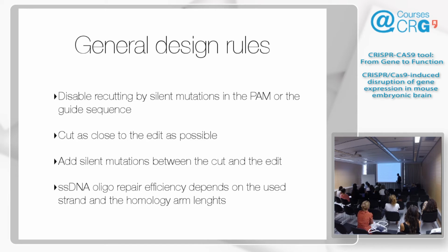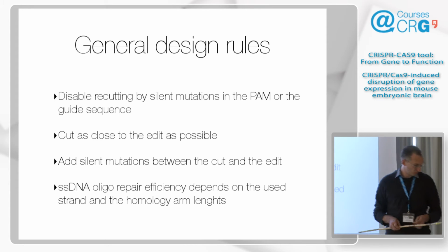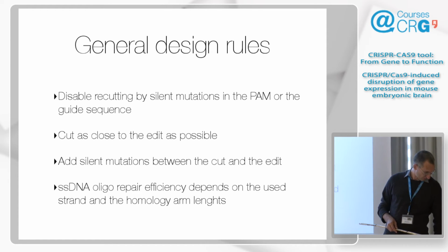So then another thing that really affects efficiency a lot is the distance between the cut and the edit. You should place the guide as close as possible to the edit, and you should compromise on a worse guide, but closer. That's what I would tend to do rather than a very nice guide that's, let's say, 50 base pairs away, especially with oligo repair. If you use larger templates, that's much less of a problem. But oligos and large templates operate through different repair mechanisms, and it is crucial for oligos to be close. Also, it's not possible to have oligos longer than 200 currently, so that's another issue.